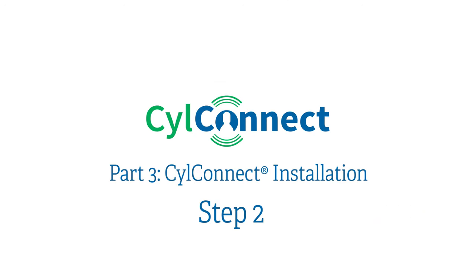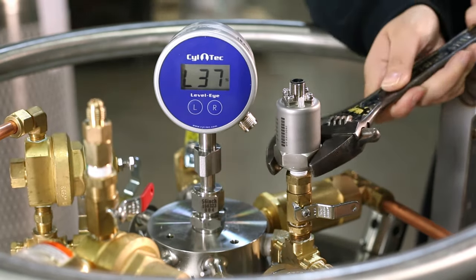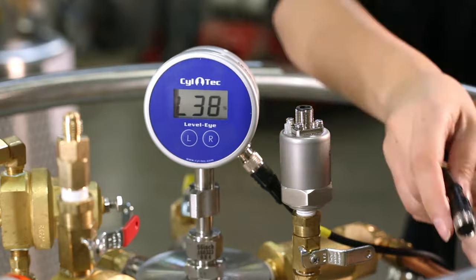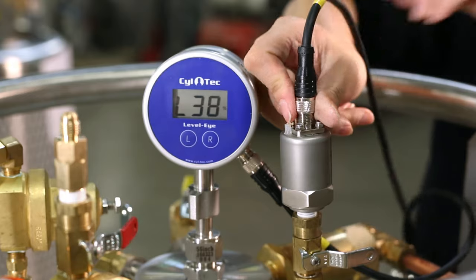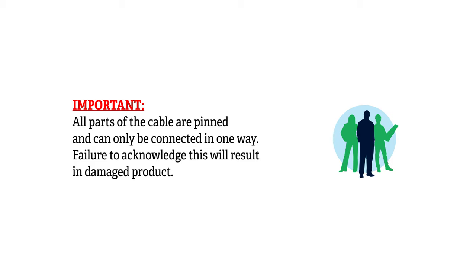Step two: if you are also monitoring pressure, plumb or T the pressure transducer into a port that communicates directly with the tank's headspace. The transducer has quarter-inch male NPT threads. Once the transducer is tightened, simply insert the cable marked B to the pressure transducer. All parts of the cable are pinned and can only be connected in one way. Failure to acknowledge this will result in damaged product.